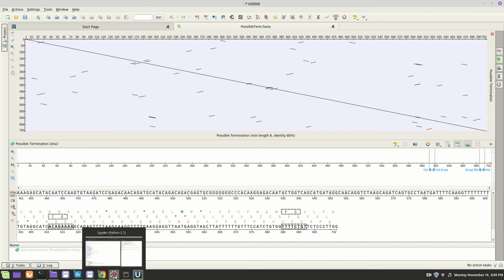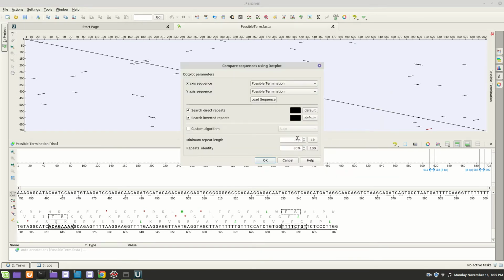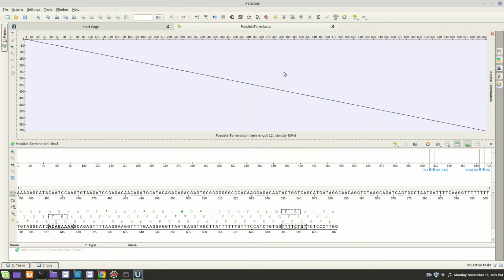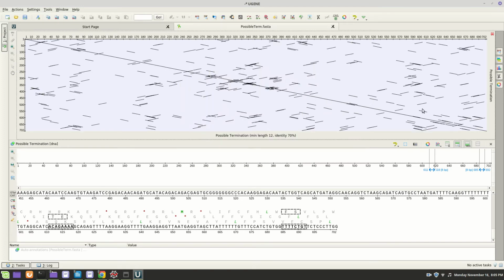And let's make it longer and less restrictive. So let's make it 12. Makes everything go away. So we cut this back to, I don't know what, 70. Do we do this number? Yeah, I like that right there though. Yeah, that looks good. Could be it, but those are pretty long, but hey, there's some here that are together. That looks good too.